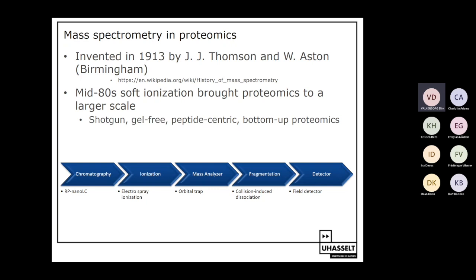So these two ionization techniques allowed us to ionize proteins or peptides without breaking them during the ionization phase, and that's important. Okay, so small anecdote: there was a Nobel Prize awarded for these two ionization techniques, just to illustrate the importance of that.